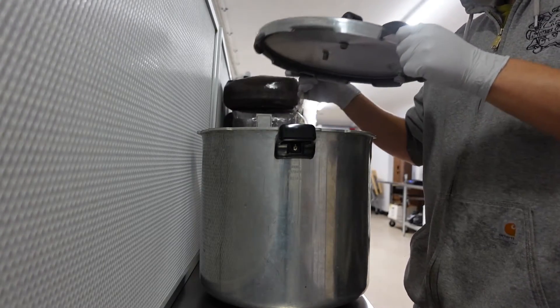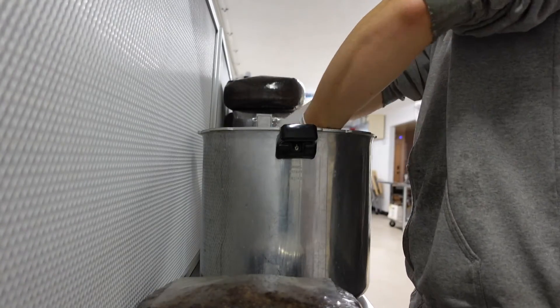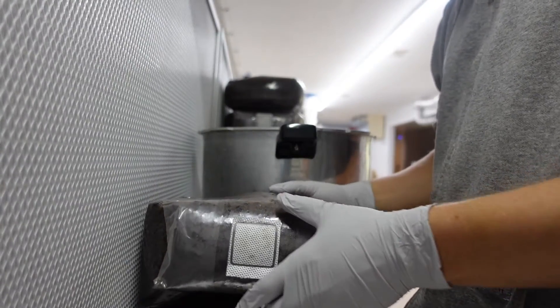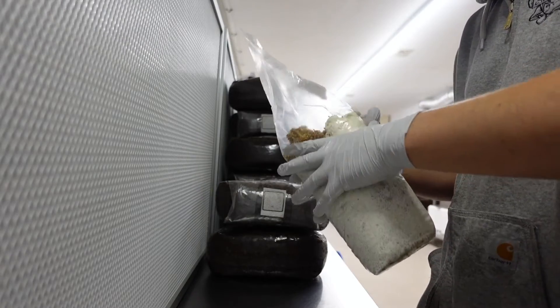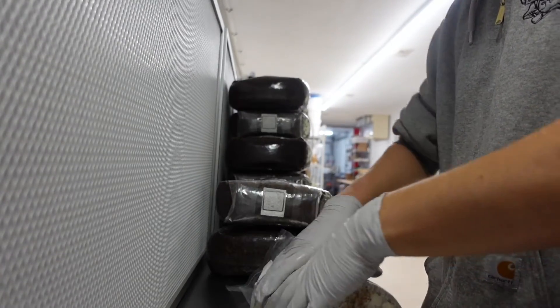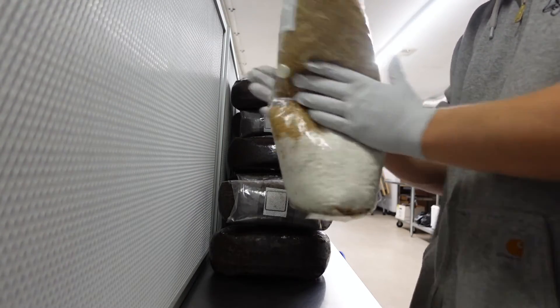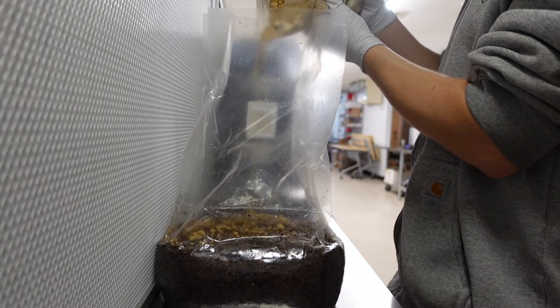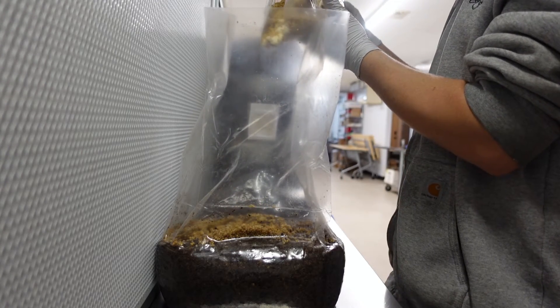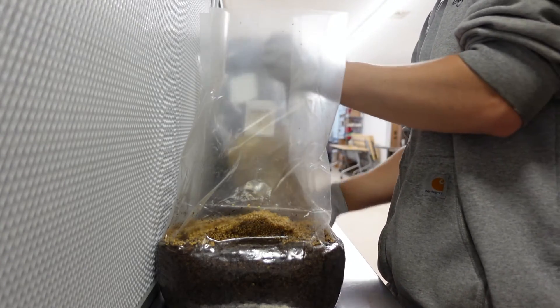Once your substrate has cooled completely, it's time to inoculate it with your fully colonized grain spawn. You can do this inoculation in open air, but a still air box or laminar flow hood is recommended for more consistent results. With clean hands, break up your grain spawn so that it will be easier to mix into your substrate. Now open up your substrate bag and pour in a small amount of grain spawn. I typically go for about a 10% inoculation rate, so if you have 5 pounds of substrate, you'll want to use about half a pound of grain spawn.